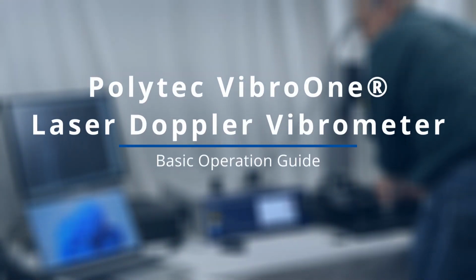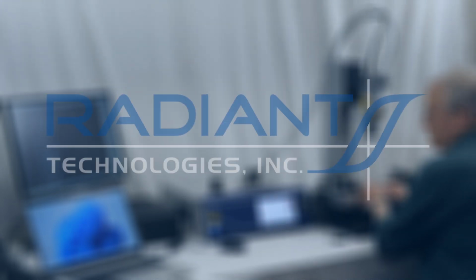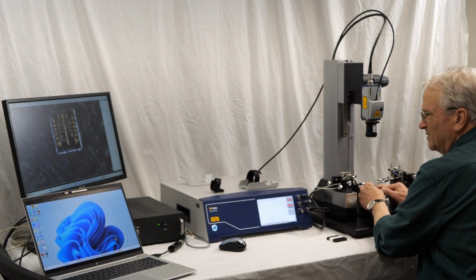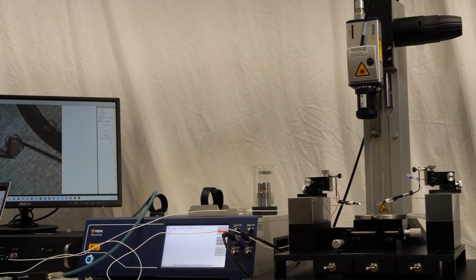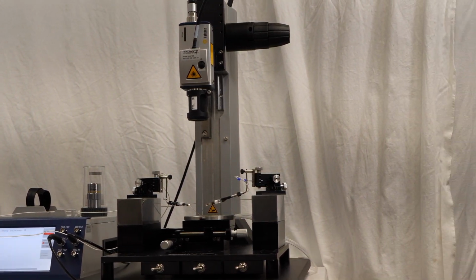Welcome to the VibroOne Basic Operation tutorial. In this video, we'll cover the basics of how to set up your measurements and environment to get consistent, high-quality measurements with your Polytec VibroOne Laser Doppler Vibrometer and Radiant Technologies Precision Materials Tester.